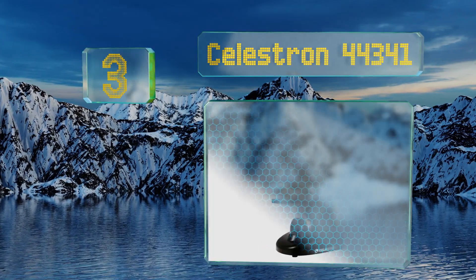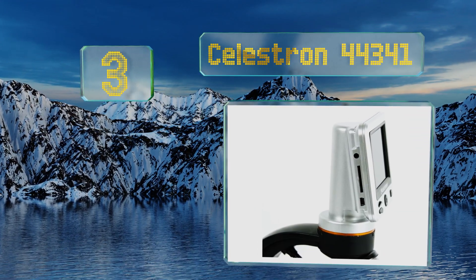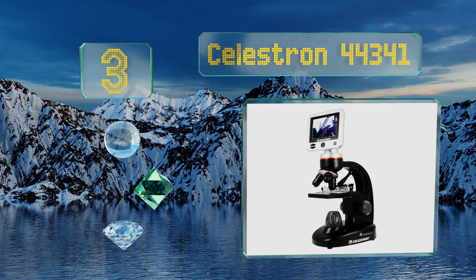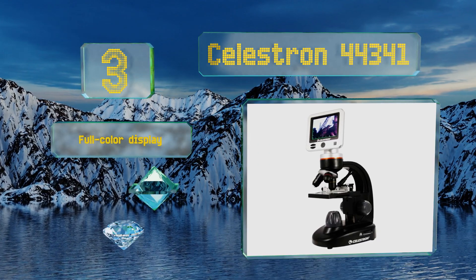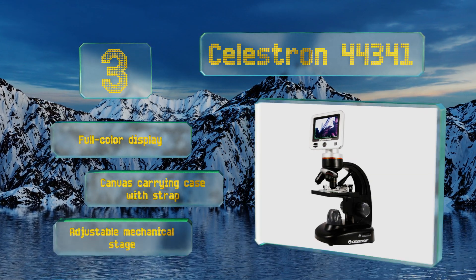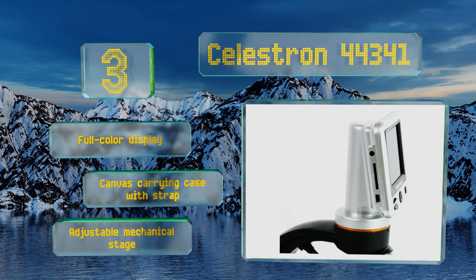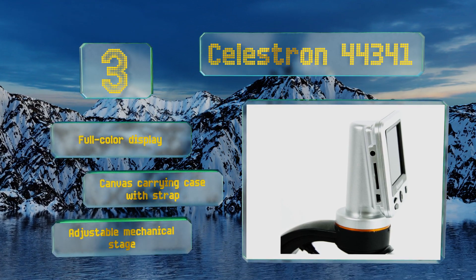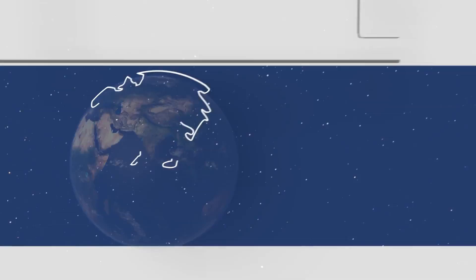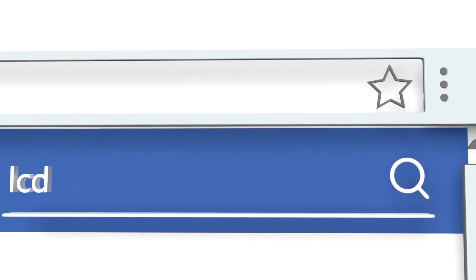Nearing the top of our list at number three, the Celestron 44341's digital camera captures high resolution images and videos of your specimens that can be viewed on the rotatable 3.5 inch screen or shared on monitors via TV output. It provides powerful magnification of up to 1600 times. It features a full color display, a canvas carrying case with a strap, and an adjustable mechanical stage.